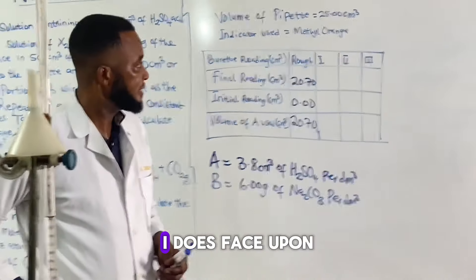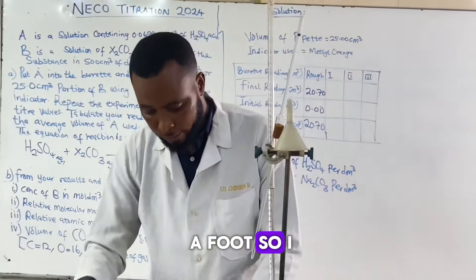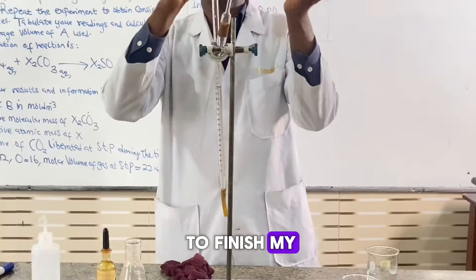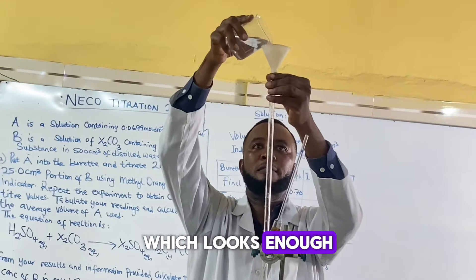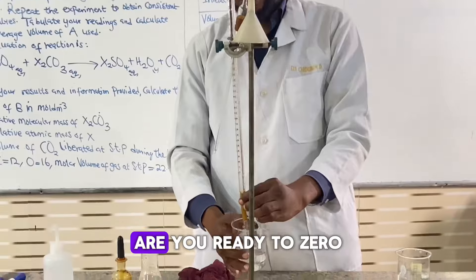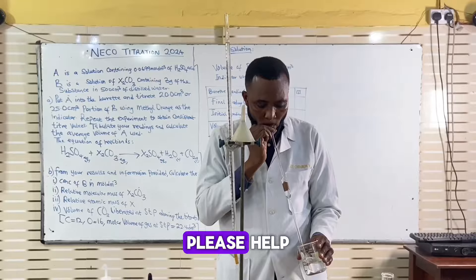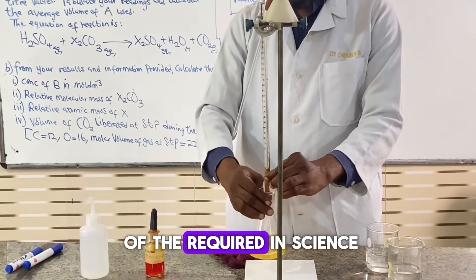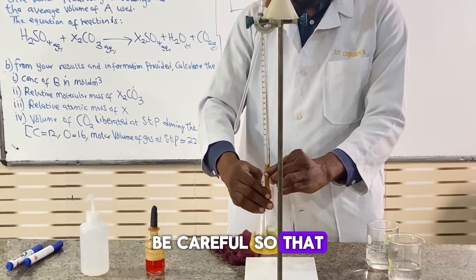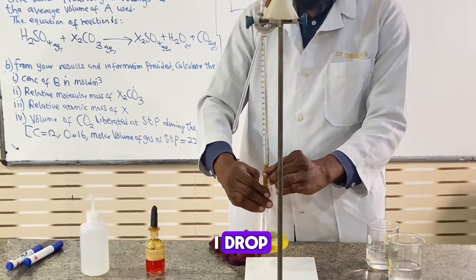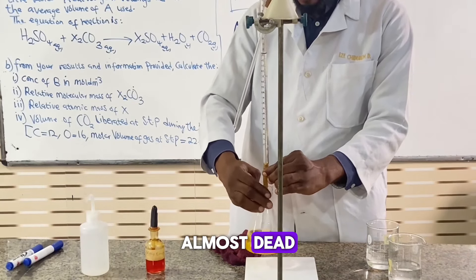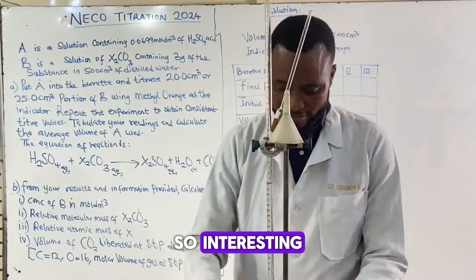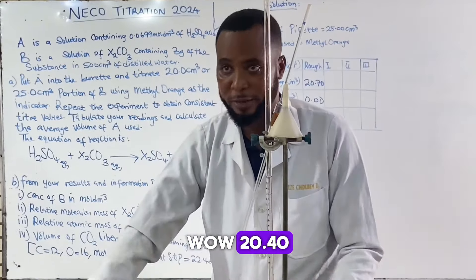I'll return back to repeat the titration. The first run is done, so I discard it. I rinse, refill my burette, and start again from 0.0 so that I will get accurate results. I keep swirling and observing — precision and accuracy are required in science. It's changing. I'm adding drop by drop. It's almost there. I am there. My reading is 20.40. That is very good. That is my second titration.